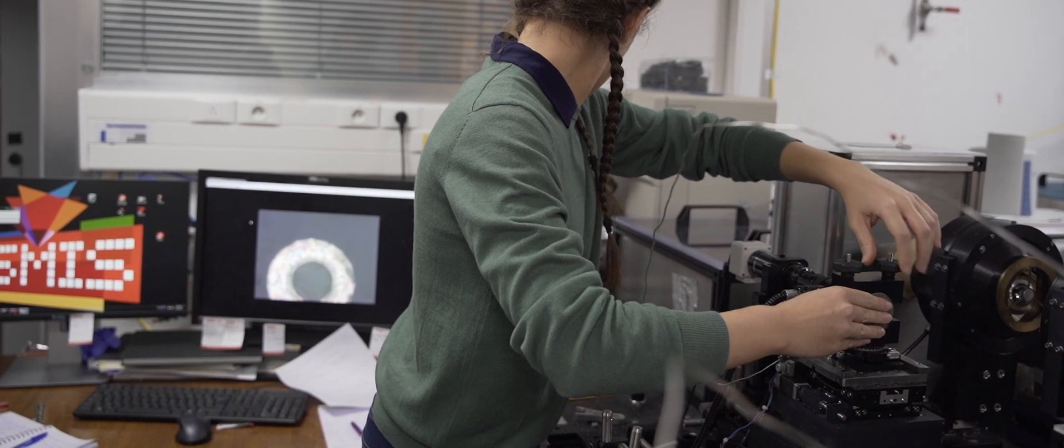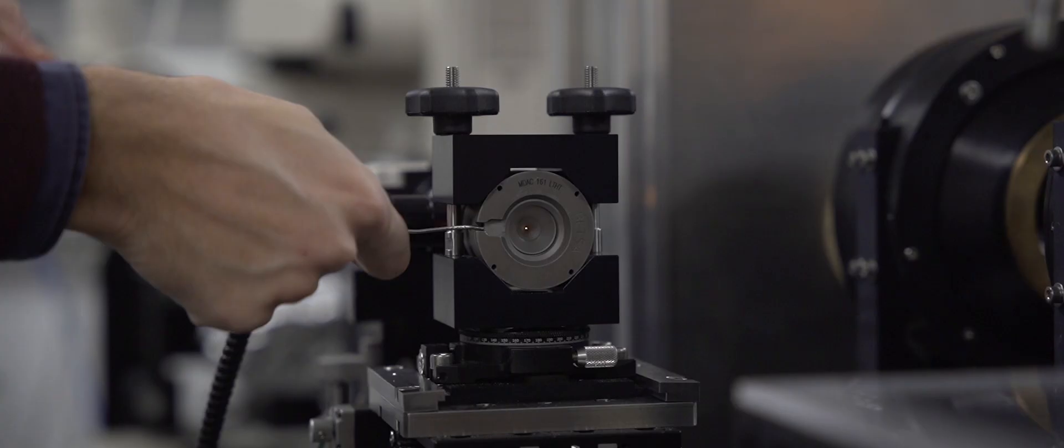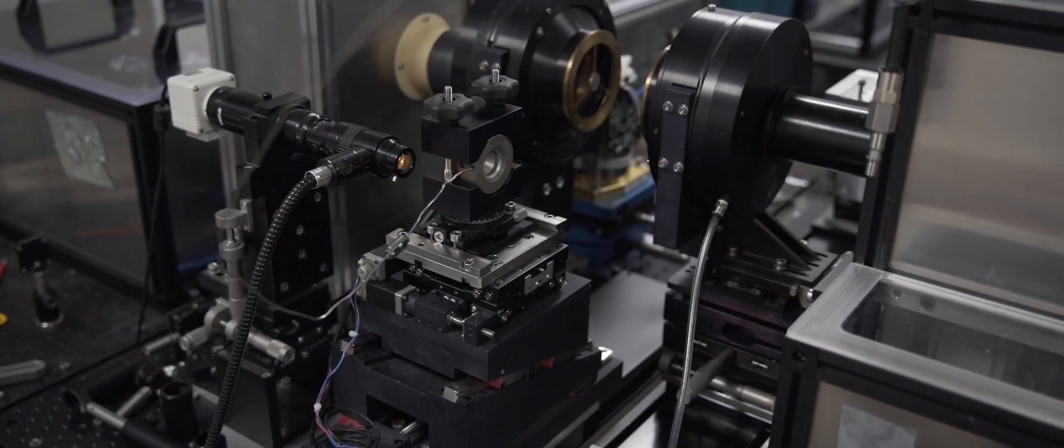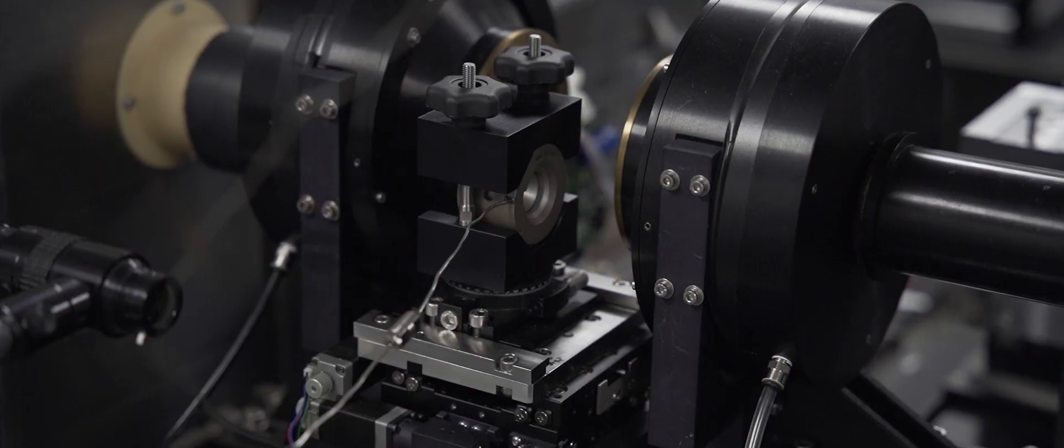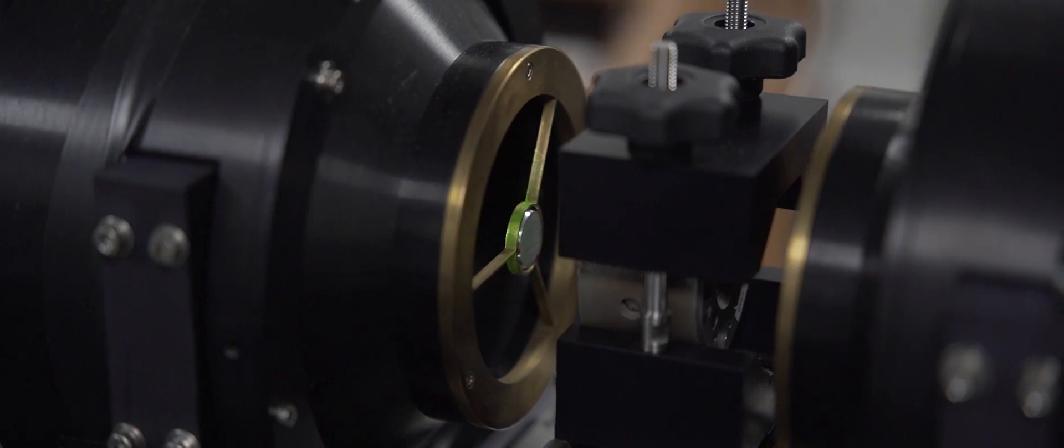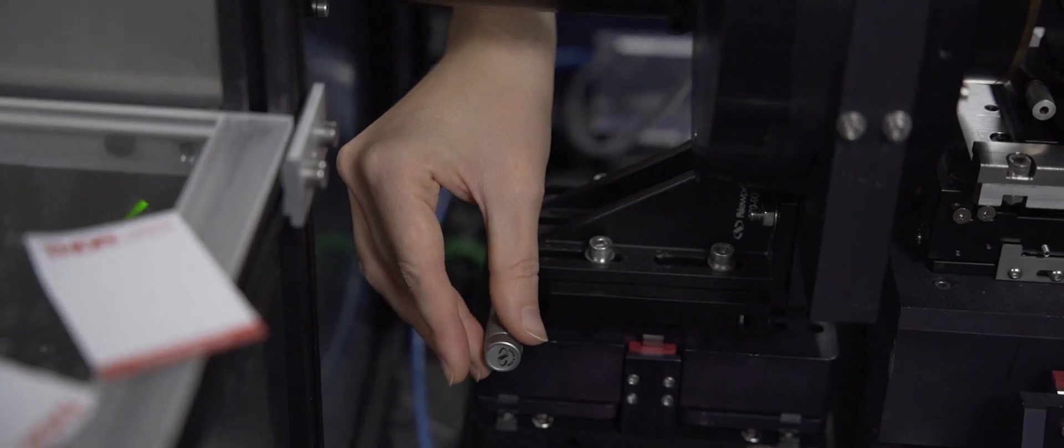It's very interesting to couple infrared spectroscopy with diamond anvil cell and high pressure. The sample inside this diamond anvil is very small, typically tens or hundreds of microns. This is why we need a very brilliant source like the synchrotron radiation, and also a microscope that we can see here to focus down the light into this very small sample inside the diamond anvil cell.